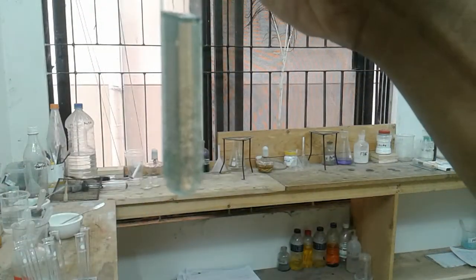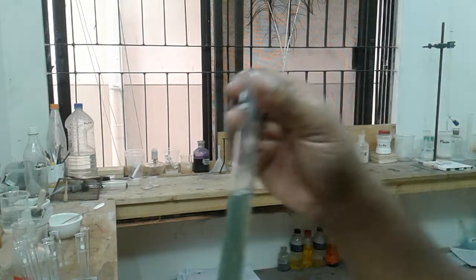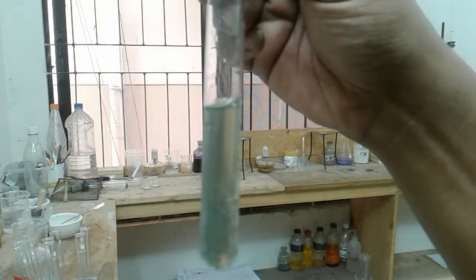As we have added more and more of the excess, the precipitate still remains, isn't it? So we have to write that a dirty green precipitate is formed, but the precipitate is insoluble in excess.